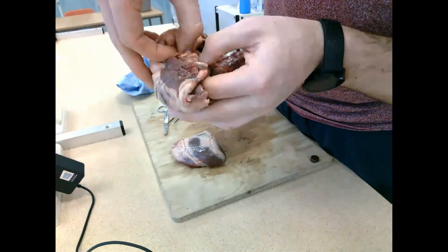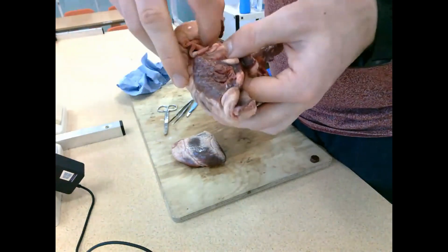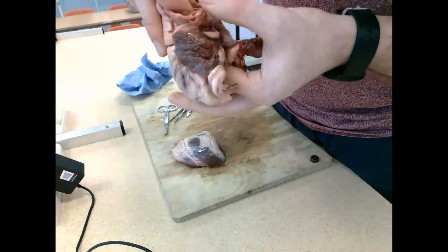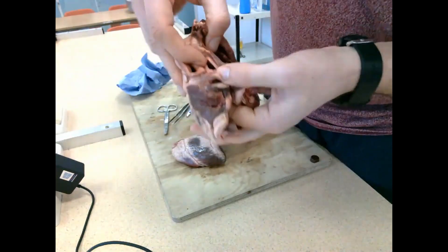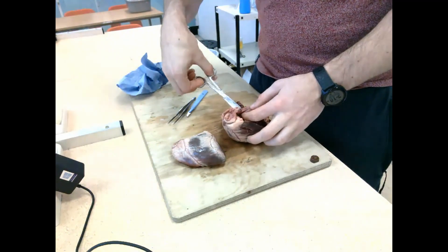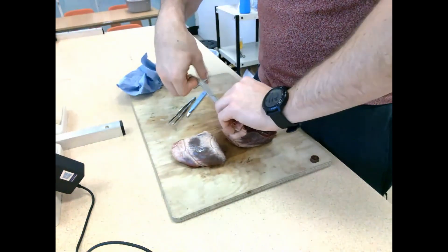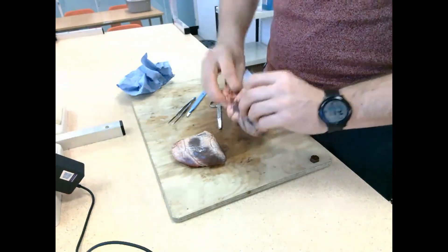Now trying to identify the semilunar valves - they're very hard to find as they often get damaged when the heart is cut out of the body. You can see the remnants of one as I push my fingers through. Note that the two arteries coming out of the top of the heart have much thicker walls but a really narrow lumen, whereas the two veins had really wide, large lumens but not a particularly thick wall.